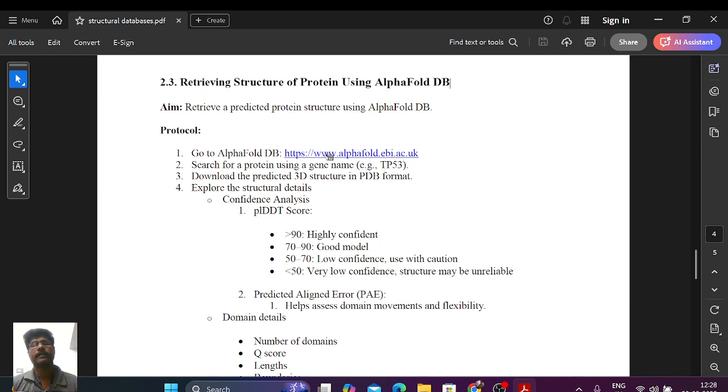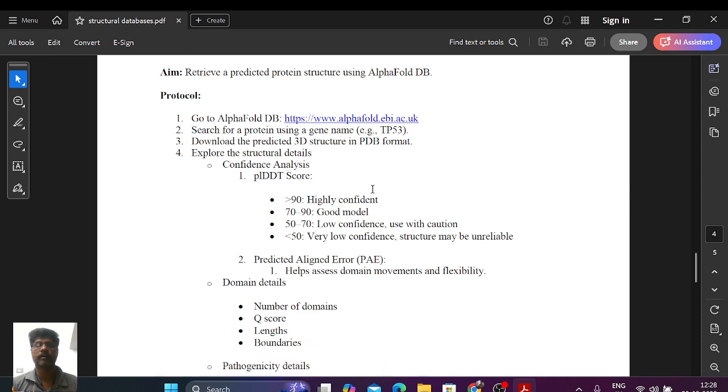Nowadays, scientists are using this database. You can directly visit the AlphaFold database, type the query sequence or name, search it, and download the structure of the query protein, right? Before downloading, the page itself has so much information, like a confidence level.